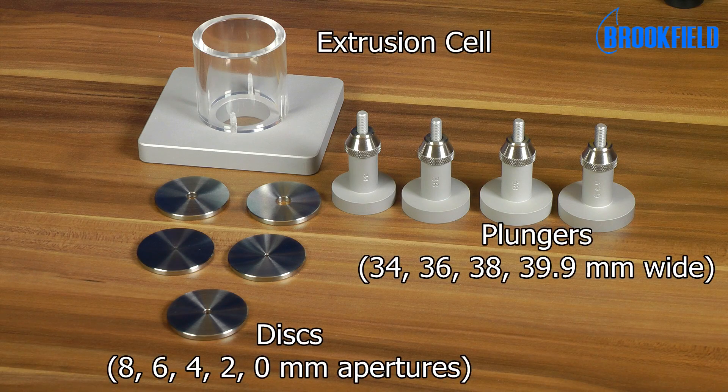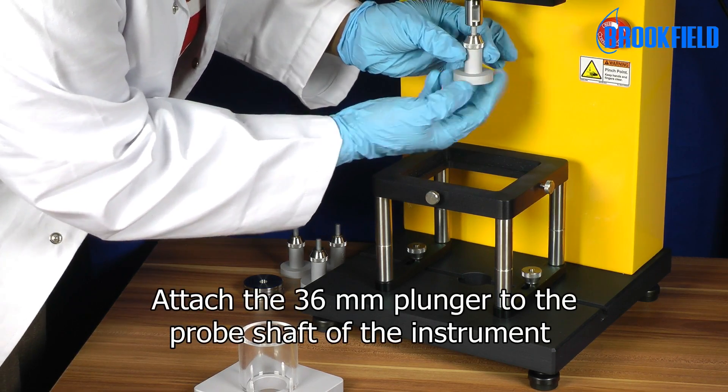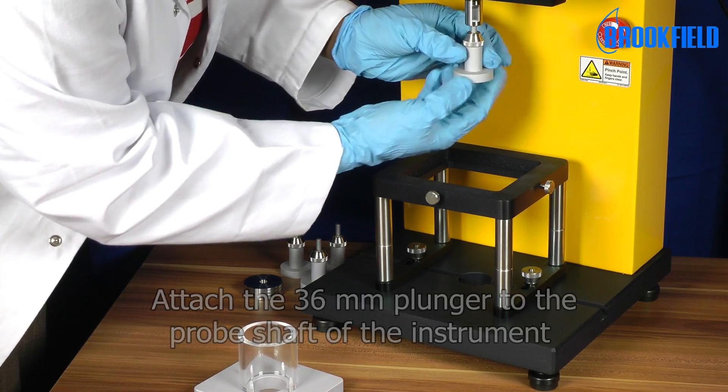Here you see the individual parts of the accessory. To set up the test, attach the 36mm plunger to the probe shaft of the instrument.